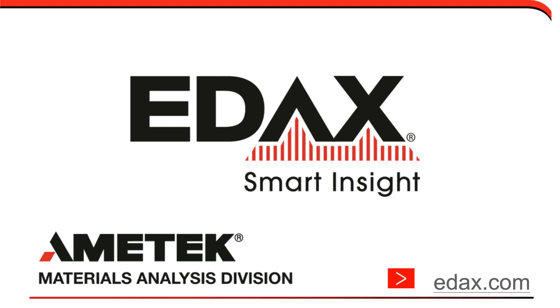There's a question here of is APEX a replacement for TEAM? Yes, that's where we're going. And there's another question, the difference. So basically right now, APEX will be replacing TEAM for EDS and EBSD analysis. There are lots of differences, but the biggest thing is trying to make the functionality easier to see through the user interface, making the data structure easier to understand and manage, being able to, again, specify where you're saving it and what name you're using.